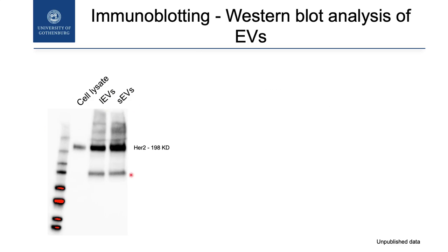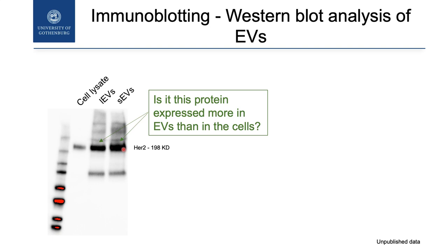This is a typical western blot. This is just an example where we loaded the cell lysate and two types of extracellular vesicles, large and small. We investigated HER2. What is important is that most of you will tell me that we really have an enrichment of HER2 in the vesicles. But the thing is, we cannot say that this protein is really more present in the vesicles than in the cells, because we don't have anything to compare with. This doesn't happen in the vesicles.